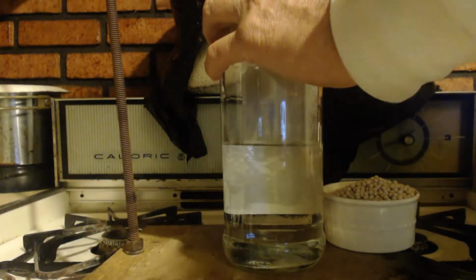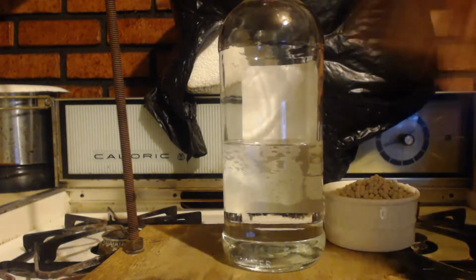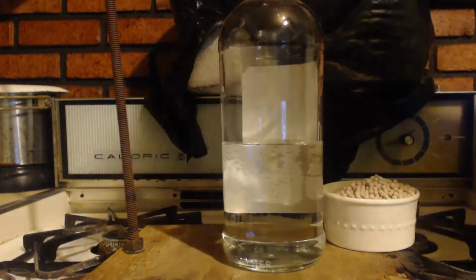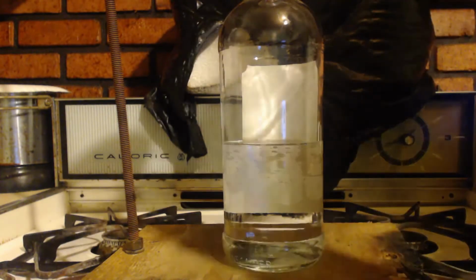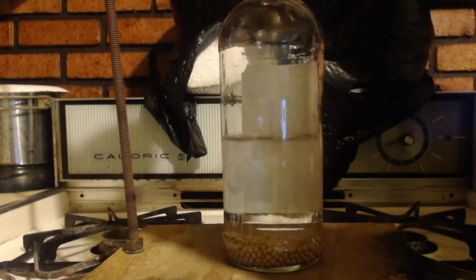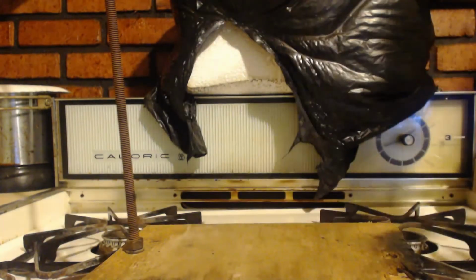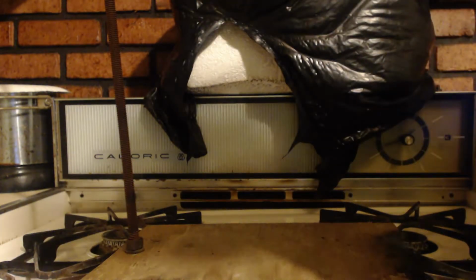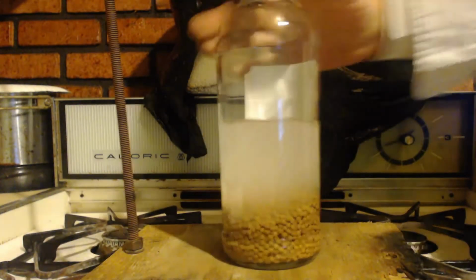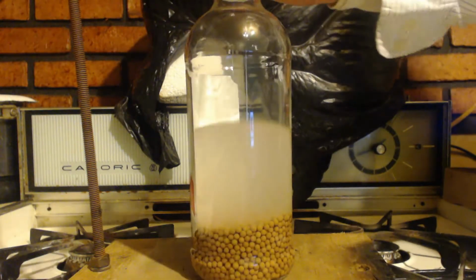Keep in mind, you want to put this in a bottle that has no extra space. I got too big of a bottle there. Because this has air in it, and air has water in it, which means you're going to just be soaking up that water. Okay, this is ridiculous how many sieves that is. Jeez. Spin it around a little bit. So that's it.